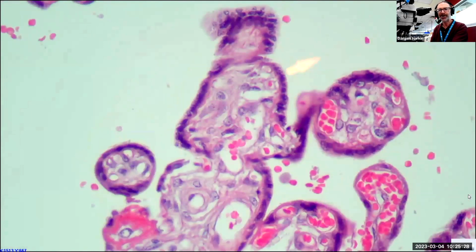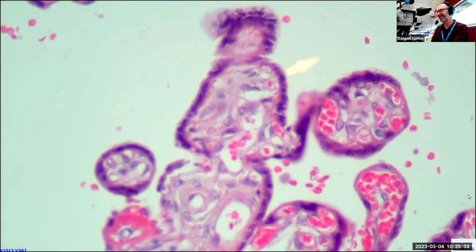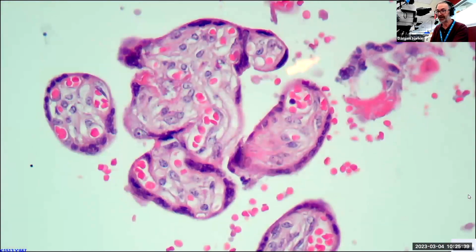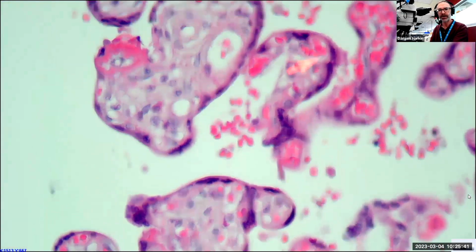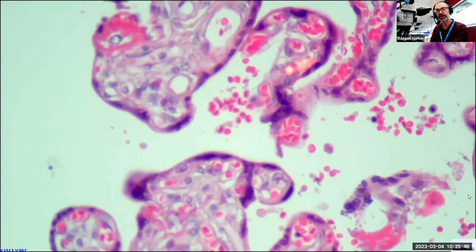And it must be alcoholic, trust me, because we've made the mistake of bringing out the aqueous picric acid on occasion, just by mistake, and it doesn't work.